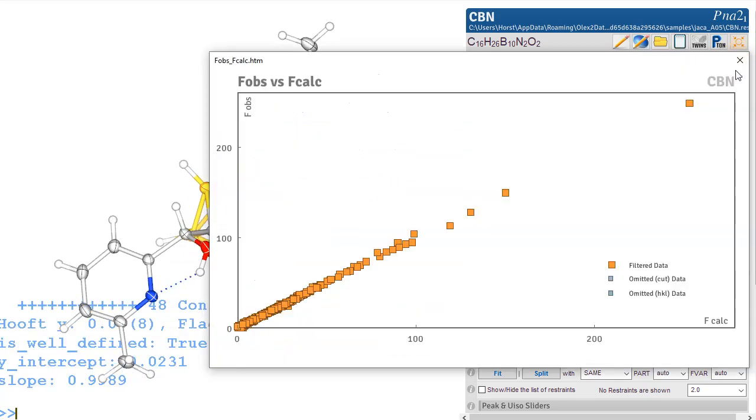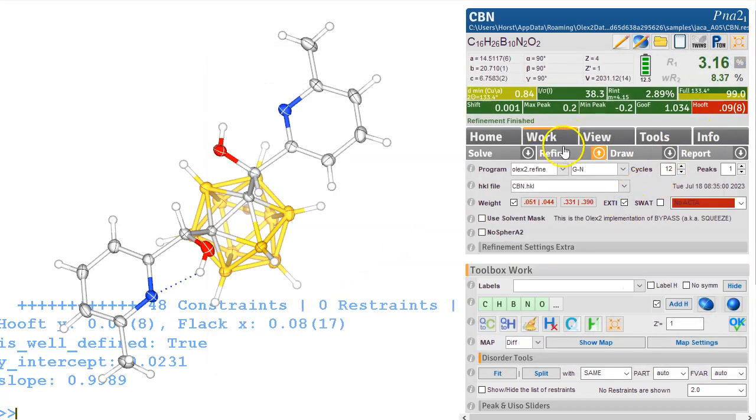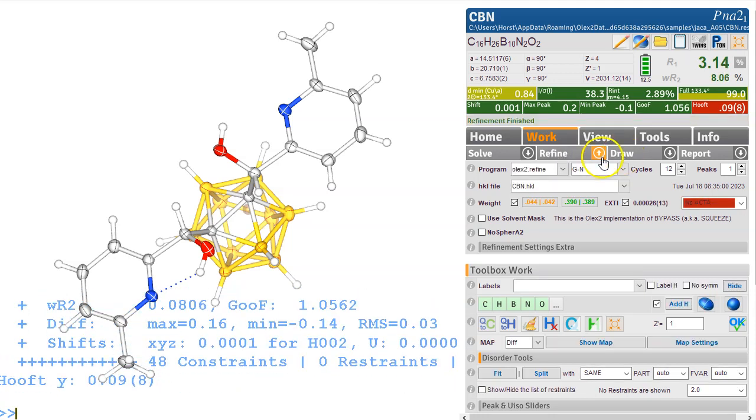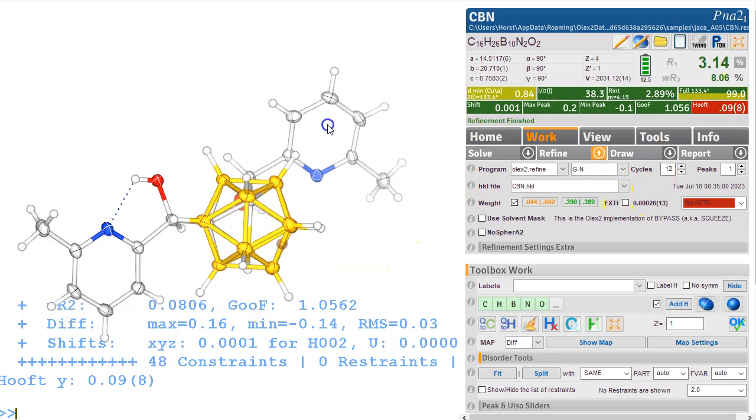Now let's look at this. This looks all nice and straight. Now we've got 200 here. Let's try whether there is some extinction. And can't do any harm to try. We have got 1326. So this is 26 is twice 13. So it's probably not worth refining this and CheckCIF will complain if you do.